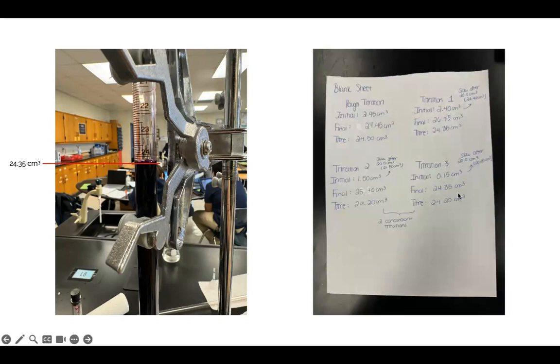Thankfully here, we got 2 concordant values, which is perfect. They're the exact same. Again, concordant values have a maximum difference of 0.1. Ours has a maximum difference of 0, so that's perfect.